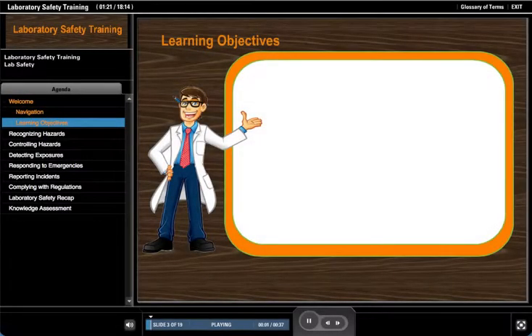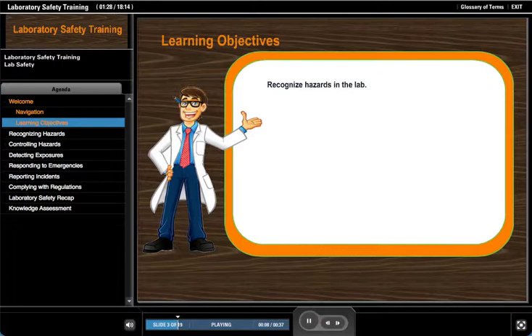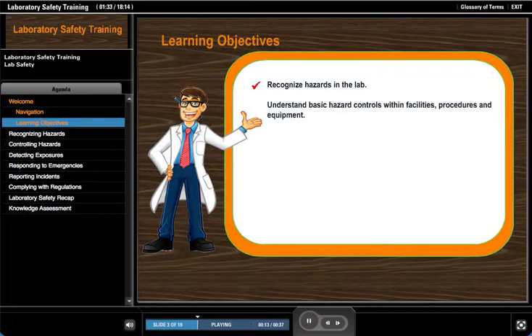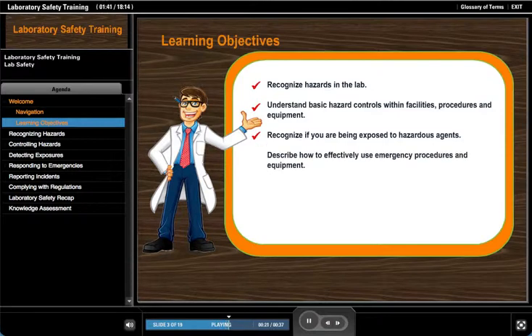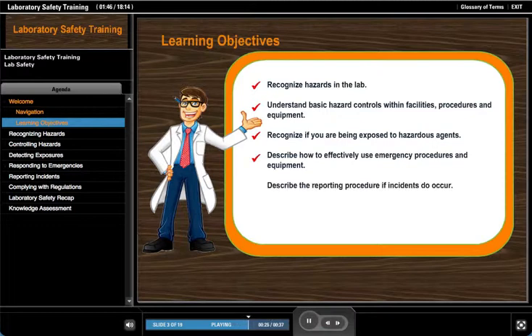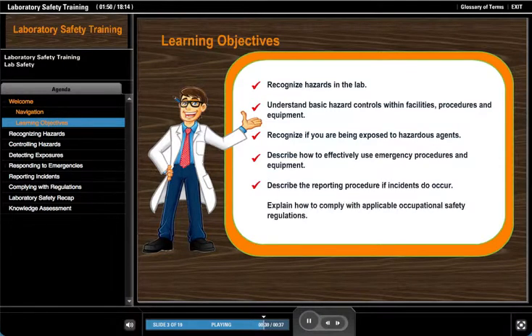Let's take a look at our learning objectives. Upon completion of this course you'll be able to recognize hazards in the lab, understand basic hazard controls within facilities, procedures and equipment, recognize if you're being exposed to hazardous agents, describe how to effectively use emergency procedures and equipment, describe the reporting procedure if incidents do occur, and explain how to comply with applicable occupational safety regulations.